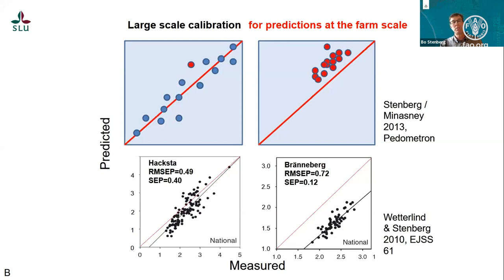So that very small difference here. But here the difference is large, and actually it's much lower here. So actually the prediction here is better than there. It might also be due to the smaller range, but still. So this is something to think about. And that's a problem we will have not only with near-infrared spectroscopy, not only with organic matter as this is, but that will happen with most techniques, at least for soil. So this is kind of a universal phenomenon. Not very strange, actually.